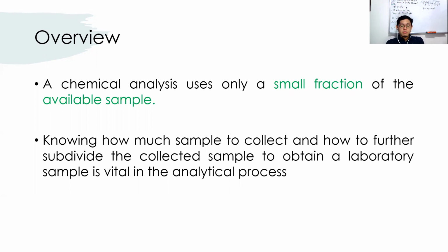Kasi meron dito mga sample na kailangan mo nang i-stabilize, kailangan lagyan ng concentrated acid para ma-dissolve yung ions.